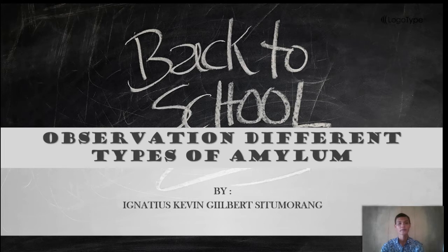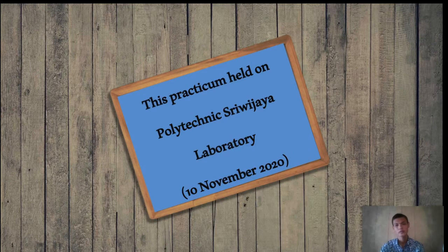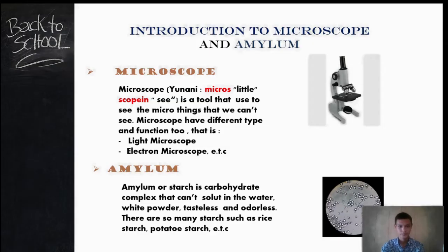In this video, I'm going to present observation of different types of amylum. This practicum was held at the Polytechnic Sriwijaya Laboratory on 10 November 2020. Introduction to microscope and amylum.